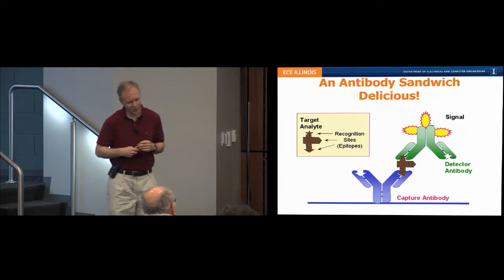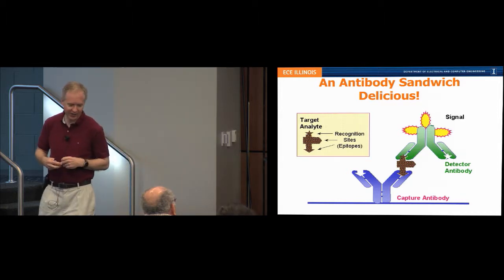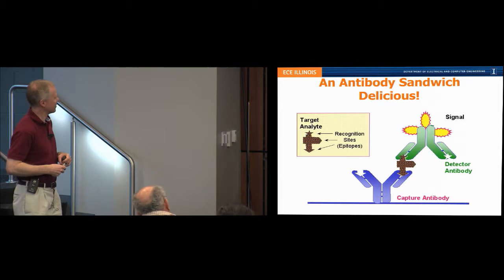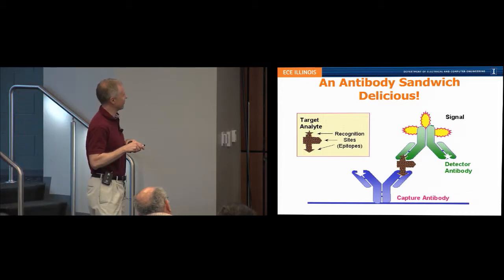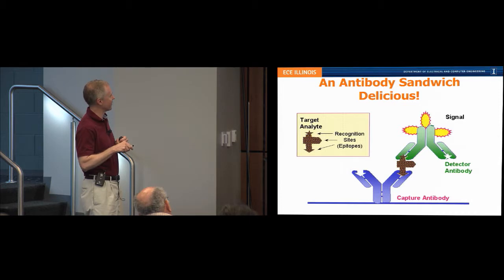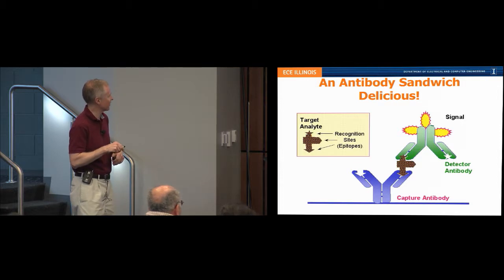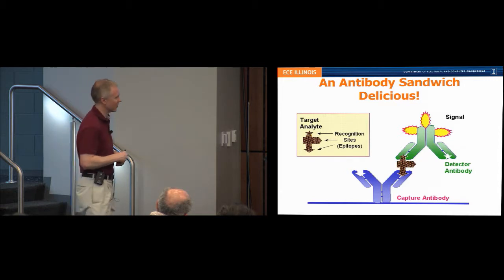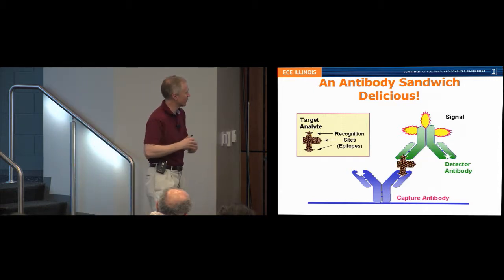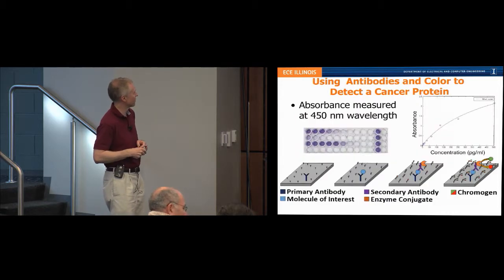And so there's a biological test. It's actually called a sandwich assay. And it's not because it's delicious, but rather because we can put an antibody on a surface, and that surface can then be used to capture one specific protein out of a test sample. In order to detect it, we have a second antibody that attaches to a different part of that same molecule that has something that will generate a signal that we can measure. So I'll show you how that works in just a second. This thing is what we call the analyte. It's what we're trying to detect. This represents the peanut allergen or the cancer biomarker or the thing we're trying to learn something about.